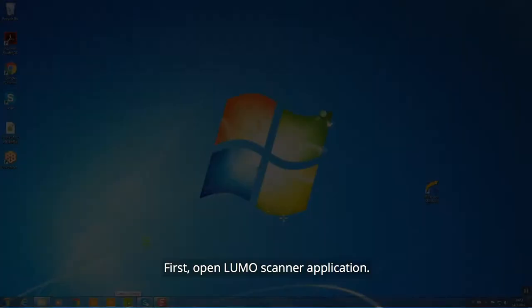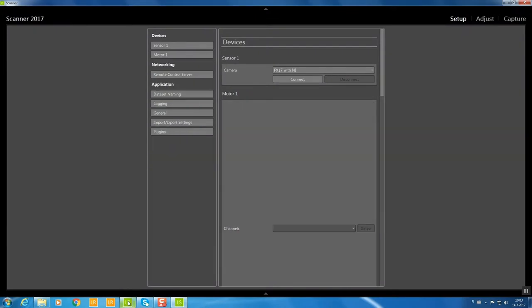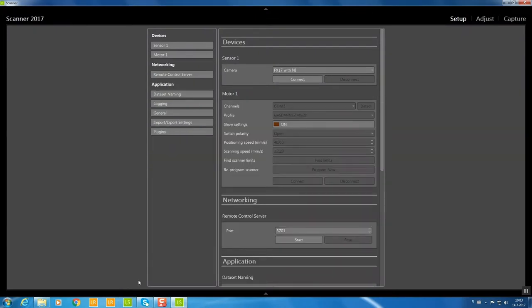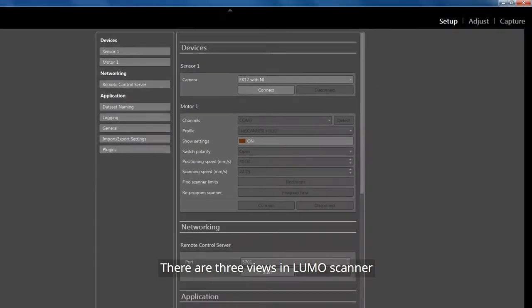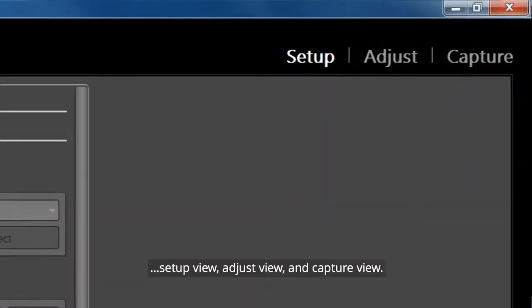First, open the LUMO Scanner application. There are three views in LUMO Scanner: Setup view, Adjust view, and Capture view. We start from the Setup view to connect to the camera and the scanner.